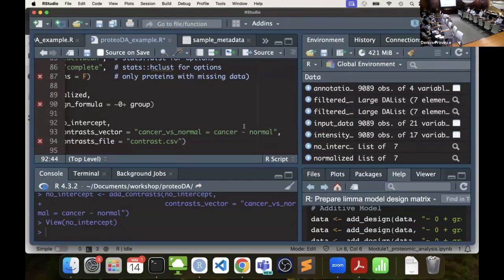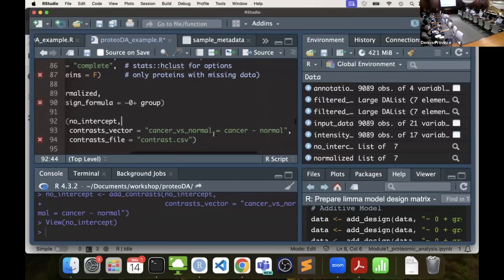And we have had issues several times. If you use a Windows machine and pull up Excel, sometimes it will add a space at the end of a group name and then it won't be able to read it. So you don't want any spaces in your files.